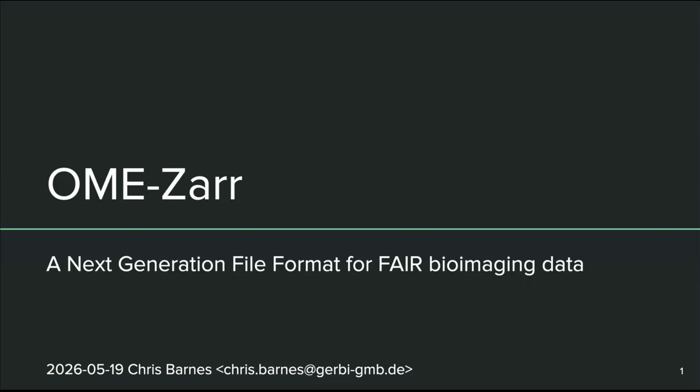Bioimaging data are becoming increasingly large and complex, and this brings new challenges for how we store, access, analyze, and share data. So today, Chris will be introducing OME-Zarr and NGFF, which are community-driven approaches to building open, interoperable standards for large-scale bioimaging data, with a focus on making data more findable, accessible, interoperable, and reusable.